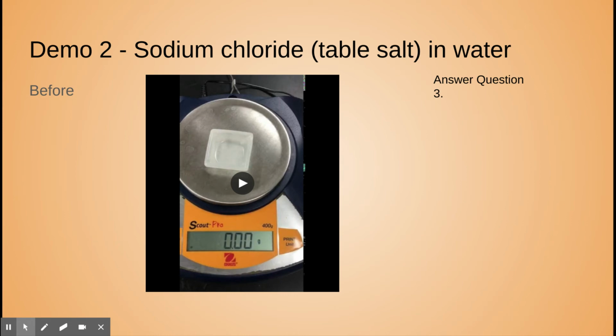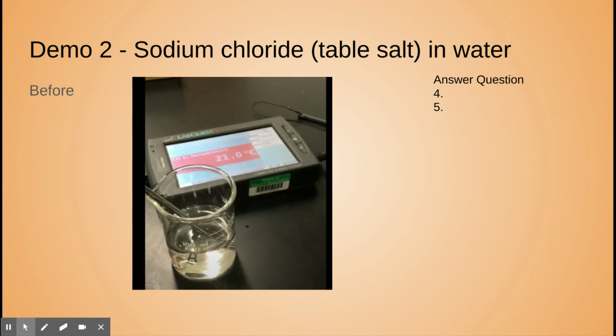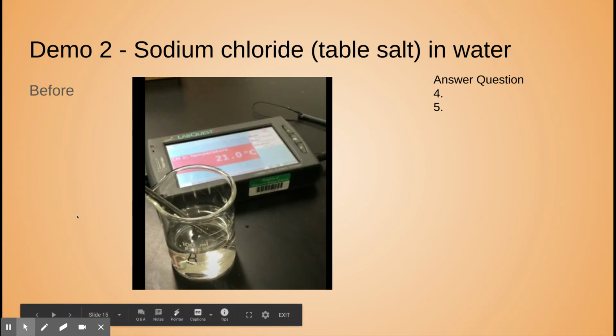From that, you should be able to answer question number 3. So go ahead, pause the video, and then record that, or calculate that, I should say. 4 and 5. So 4, we are taking the temperature on this one. And so you can see the temperature on the LabQuest. What you see in here is a temperature probe.